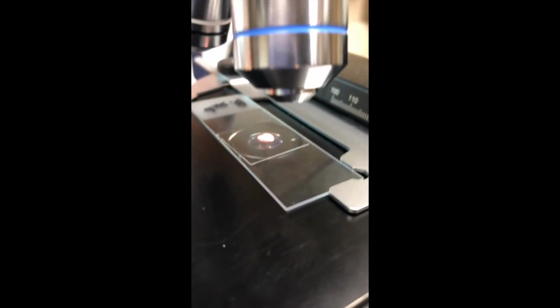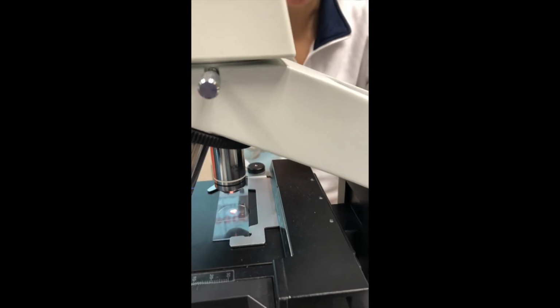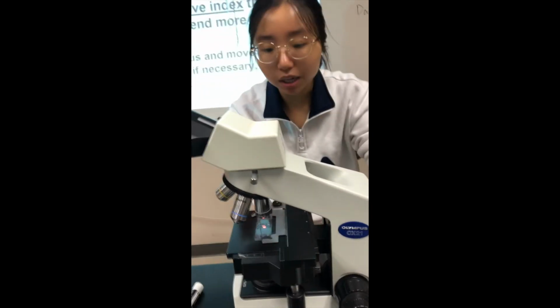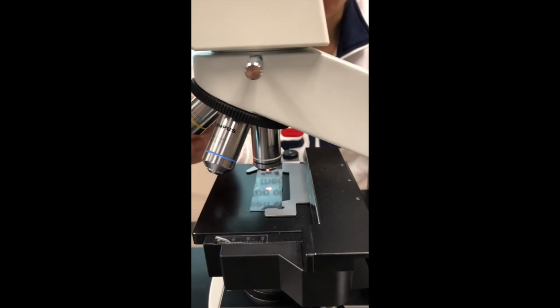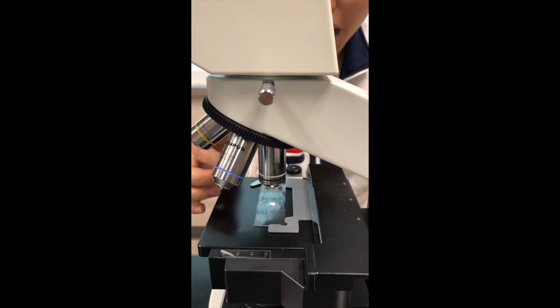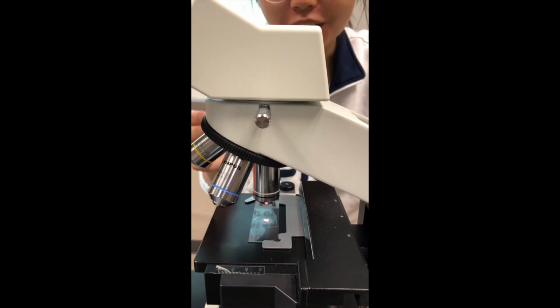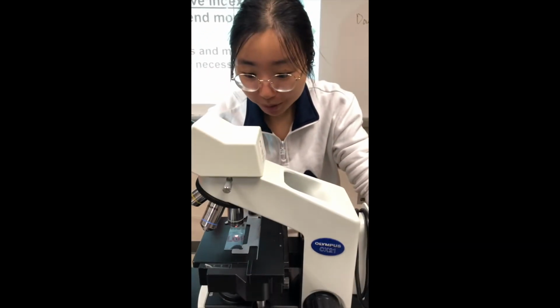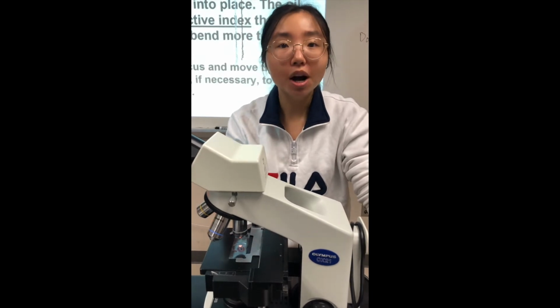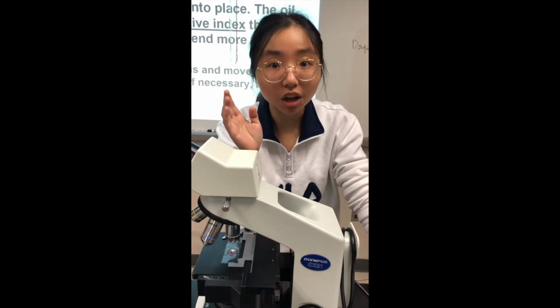Add 1 drop of oil over your slide, and then change to fine focus. The tricky part of using our compound microscope is that you want to allow your 100 times oil immersion lens to touch the oil but not touch the slide. Again, let me say it one more time: always allow your 100 times oil immersion lens to touch the oil but not touch the slide.